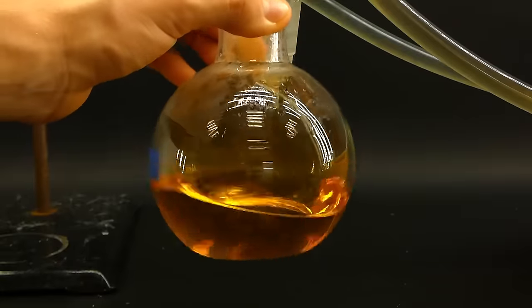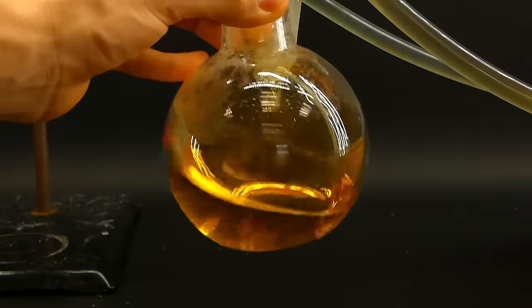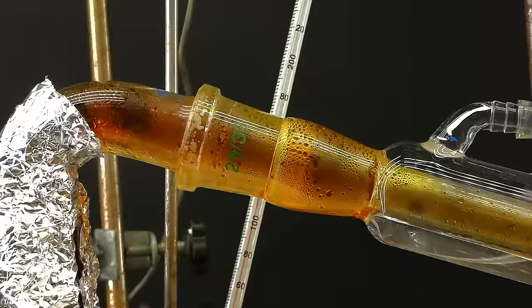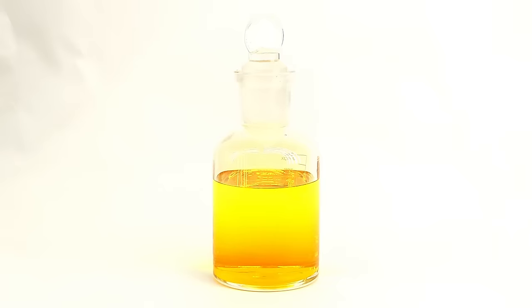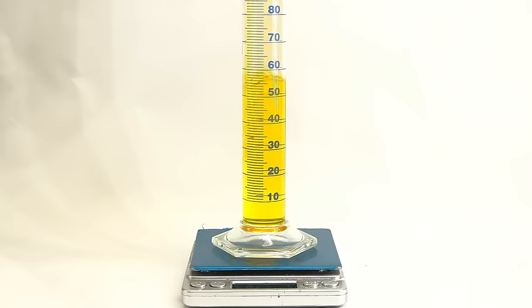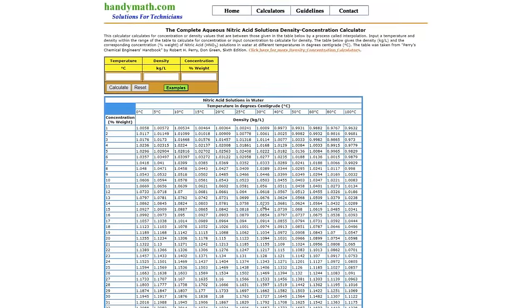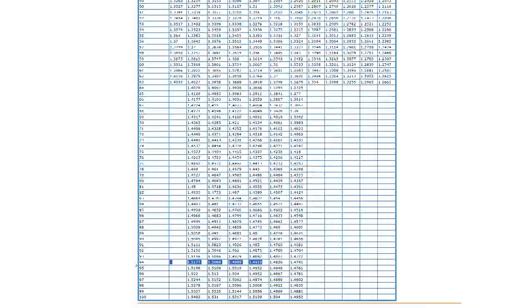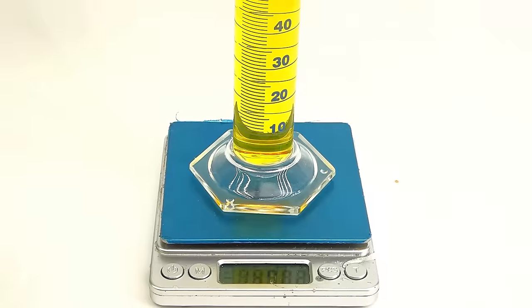The freshly made nitric acid is probably already very pure, but just for my sanity, I decided to redistill it, which left me with around 200ml. Apart from some water and nitrogen dioxide dissolved into it, it is now incredibly pure and perfect for refining metals. When it comes to its concentration, I can determine it by measuring its density, and using this handy online chart, it came out to be around 94%, which is just amazing, and actually higher than I expected.